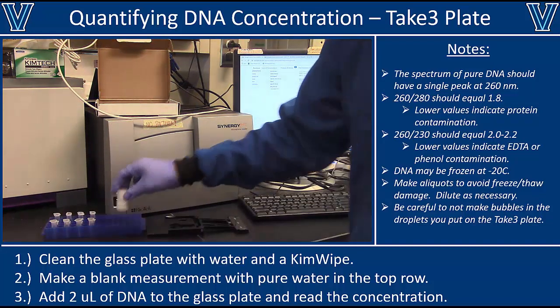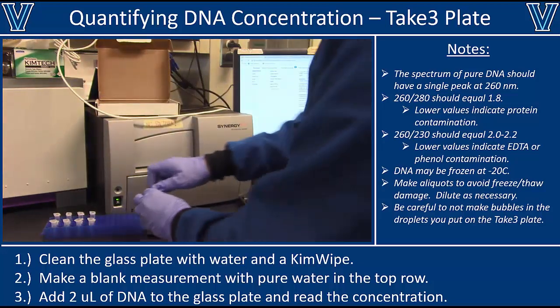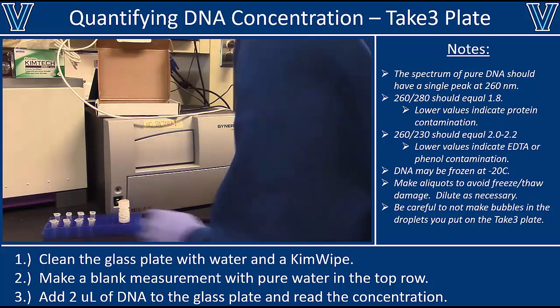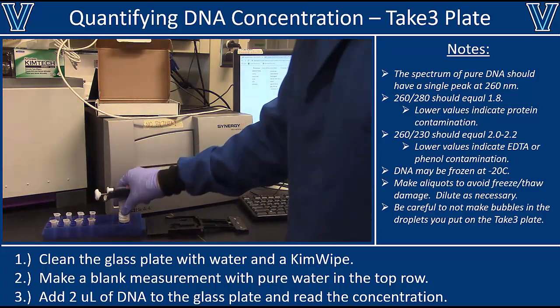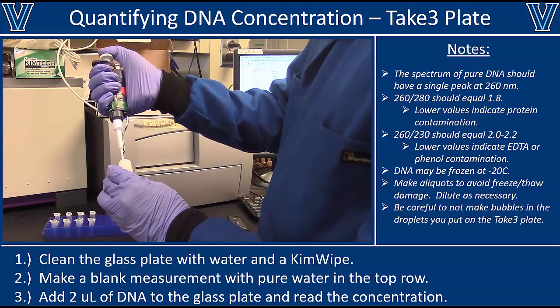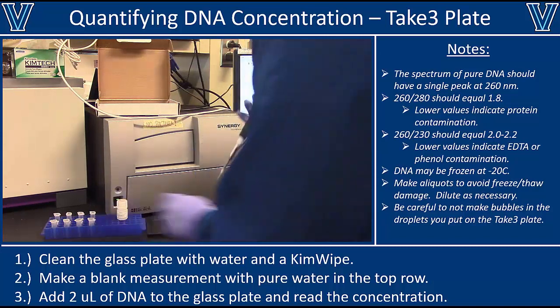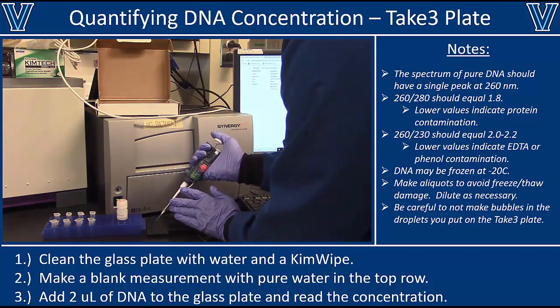In the first row, you need to load a blank. Ideally, this should be the elution solution that you used for the last step of the miniprep, but ultra pure water works here as well. We just want to get a sense for what the baseline absorbance of the plate itself is so that we can subtract it from these samples to get a more reliable estimate of the DNA concentration.